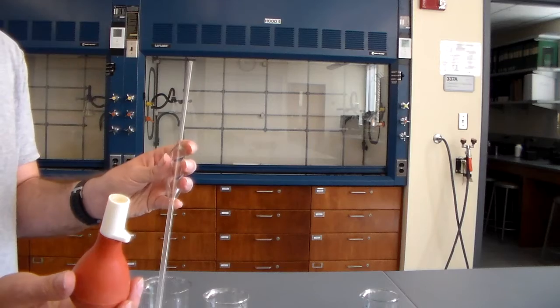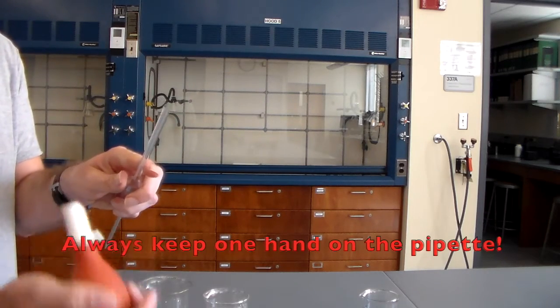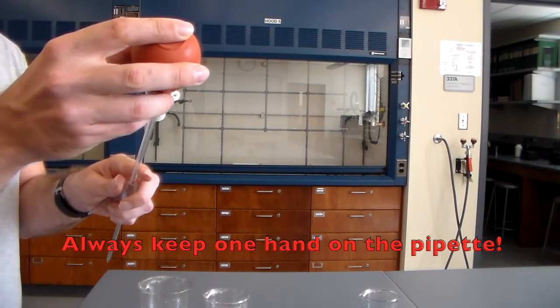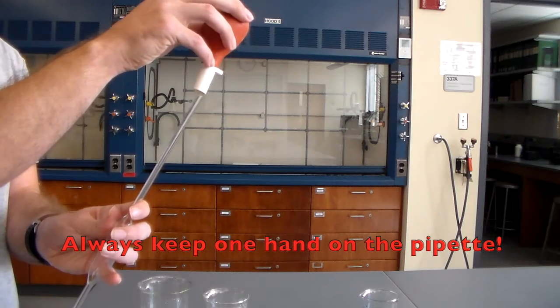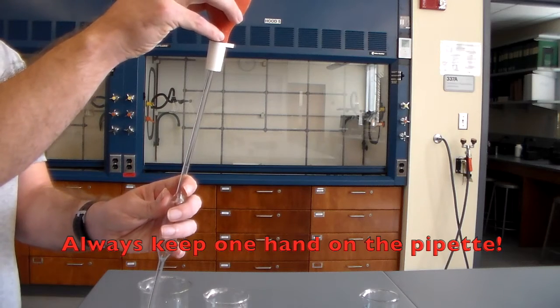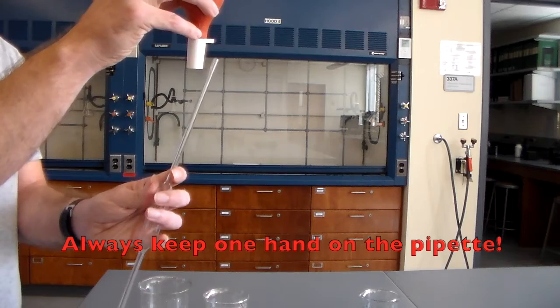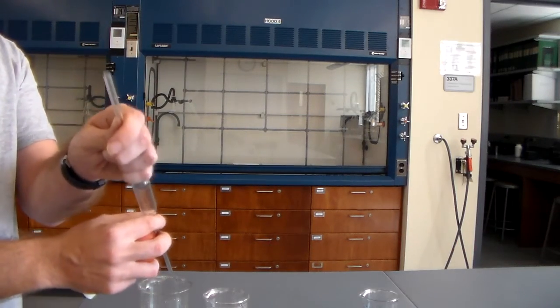When you are using your volumetric pipette, always make sure to have one hand secure on the volumetric pipette and the other hand secure on the bulb. Do not assume that the bulb is going to be holding the volumetric pipette. These are only supposed to be gently fit in with one another. They will not hold. If you just try holding the volumetric pipette with only the bulb, the bottom part will drop out and it will break. So please make sure that you always have one hand secure on the pipette itself.